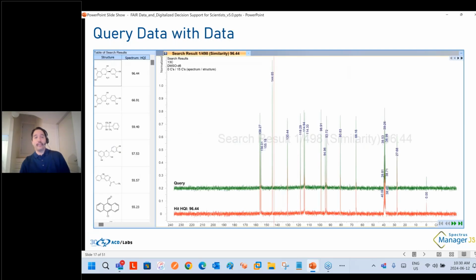And like I said, just being able to search data with data is a crucial thing. So here you can just have your carbon NMR, have your search results that show you a similarity score. But on top of that, overlaying live data, just that capability alone. So you're making sure that you're not duplicating any work. We're not re-elucidating anything. Being able to de-replicate becomes quite important for every user, just of any organization that's trying to just handle a lot of data.